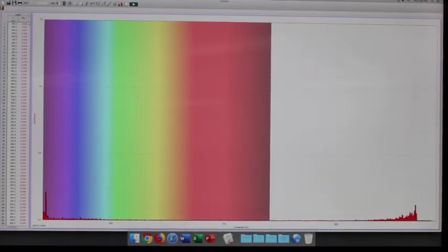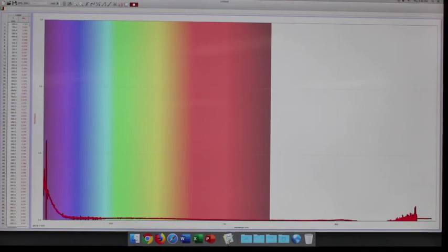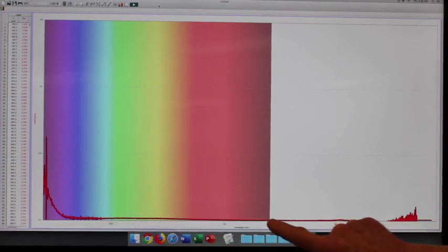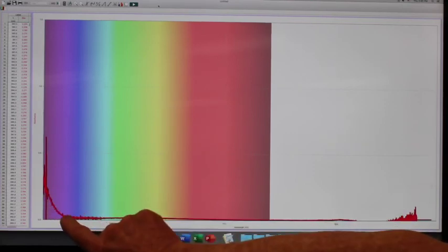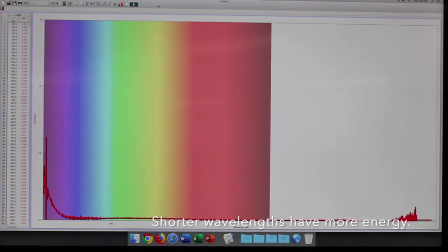This is onions soaked in DI water. I'm going to press play up here. I'm actually going to erase and continue, get rid of that red line, and then press stop. And this basically is where we're absorbing. So onions are purple, which is interesting because here we're actually reflecting off all of this blue light clear up through the red. We're actually absorbing purple. So the fact that our onions are purple means that we're reflecting the purple while we're absorbing this purple, and that changes the color of purple that we actually see reflecting off from those onions.